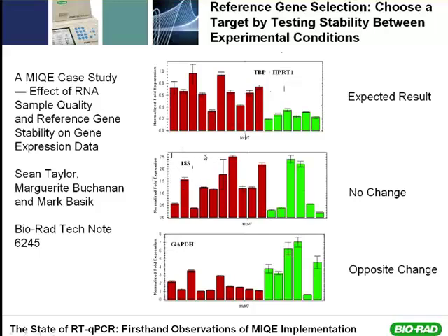Here, though, when we used 18S to normalize, we had no significant difference in the average of the normal and the average of the treatment conditions. And when we used GAPDH, we actually got the exact opposite effect. So now the normal samples look like they were increasing in expression for MCM7, and the treated sample and the cancer samples had a decrease.